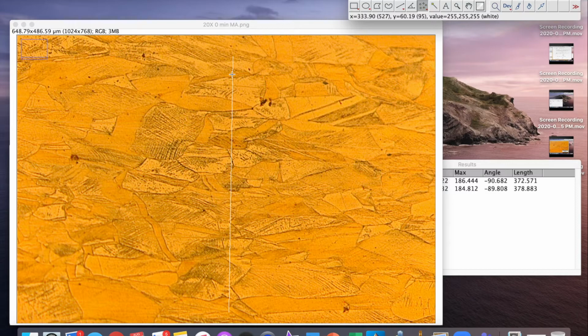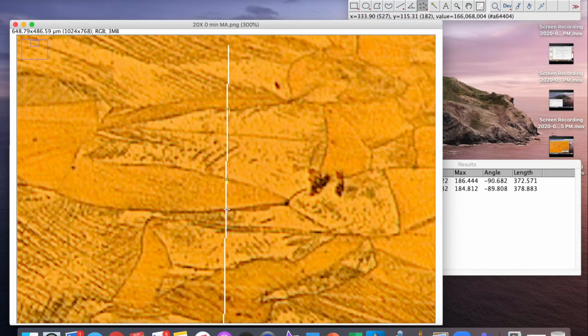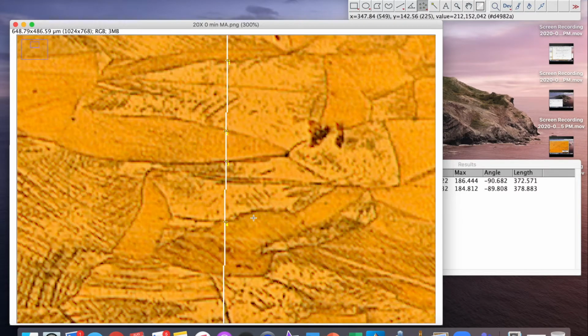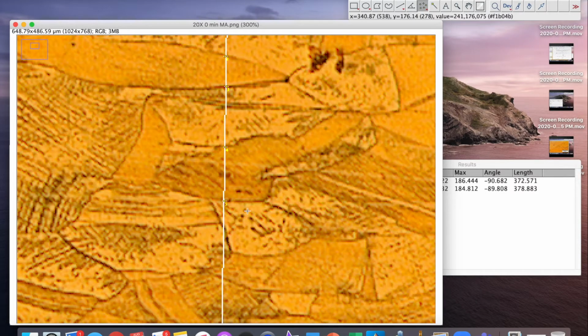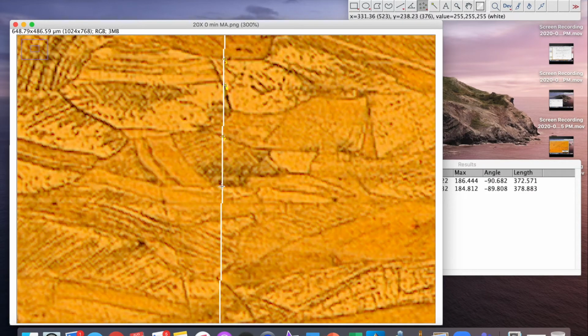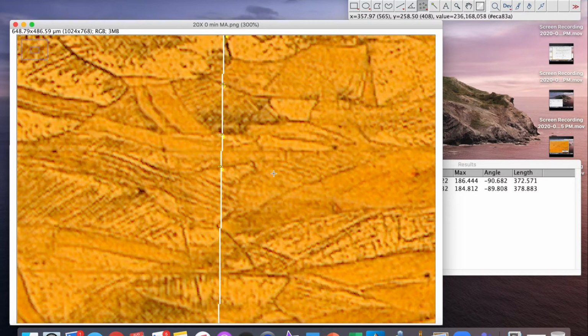And again, I'll zoom in so I can start, right? And here I can click a point where my first line is. This is where my second, third, and I keep clicking the multi-point feature everywhere that I see an intercept, right? So now it's counting it for me. So that would be one way I could keep track of those intercepts if it's hard to do manually.